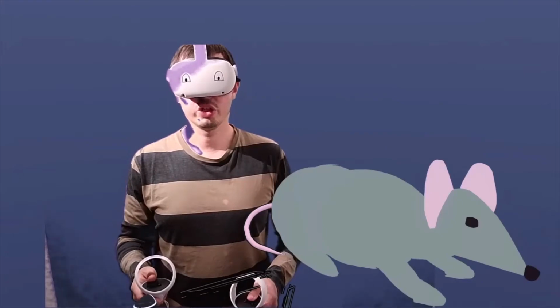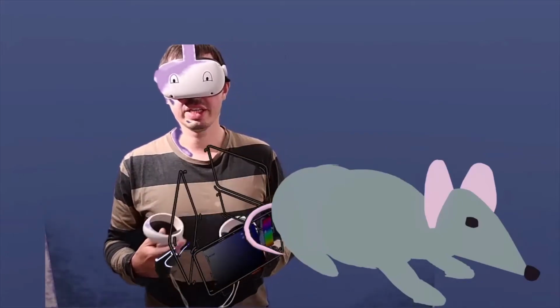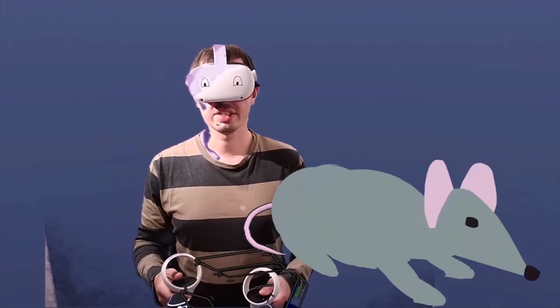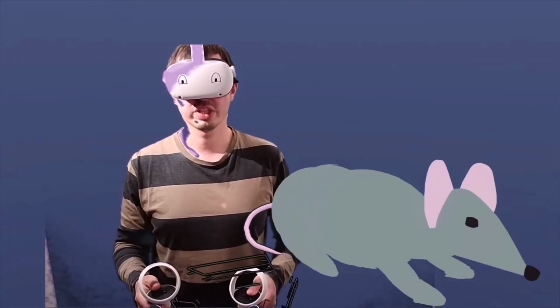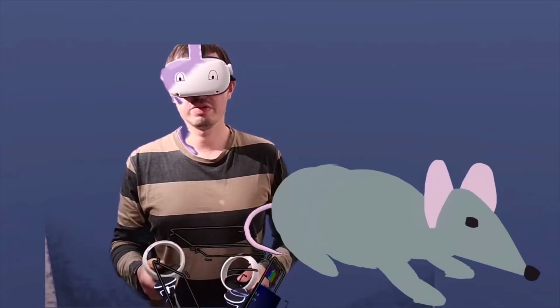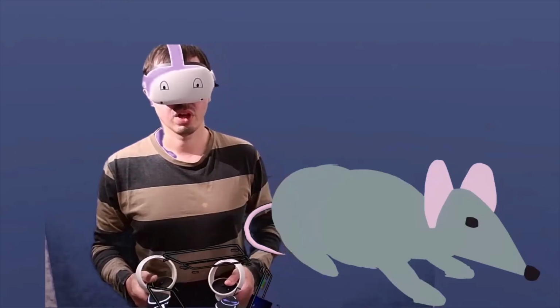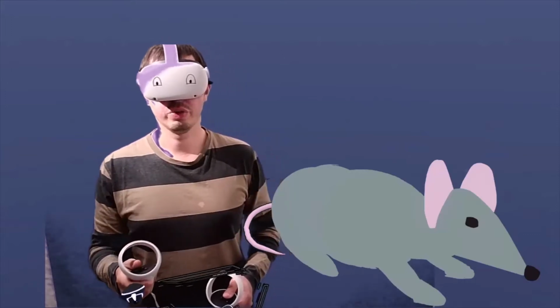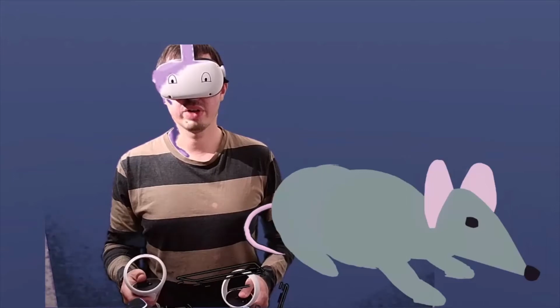The antigen being human, when you inject it inside a human body, it's very likely that nothing will happen at all, since it is recognized as a self-antigen. The immune system recognizes it as part of the human being and will not react against it. On the other hand, if you inject it into a mouse, then you will get an antibody response, an immune reaction.